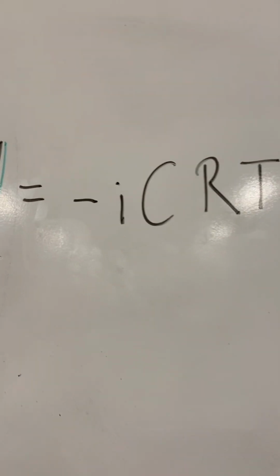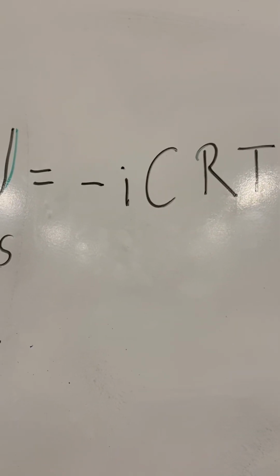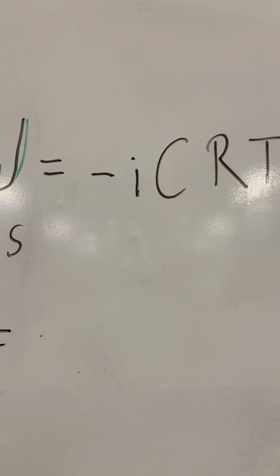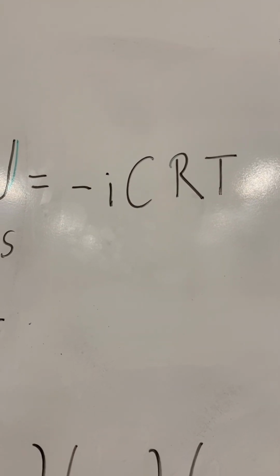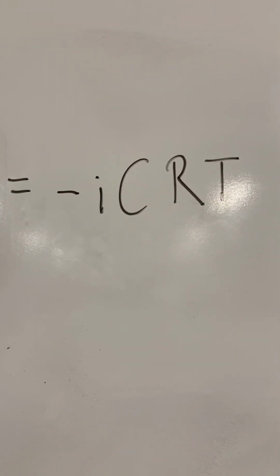And there you have this negative sign. I is the ionization rate, but sugar does not ionize in water. It does not make any ions like salt does. Therefore, the number for I will be 1. The concentration you use is the concentration that you just read off your graph and put on that little line.